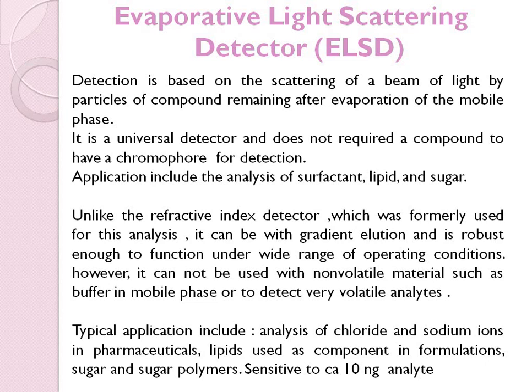This ELSD provides good sensitivity for non-volatile analytes at the nanogram level. The column effluent is nebulized and then evaporated to form fine particles. It is targeted for lipids, sugars and high molecular weight types of compounds.